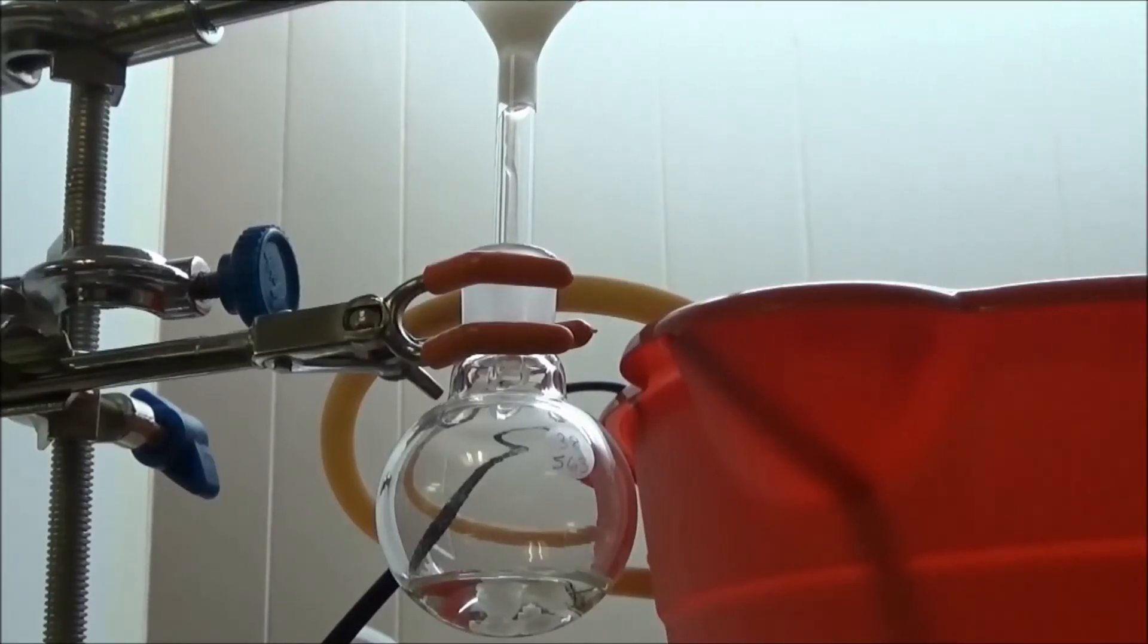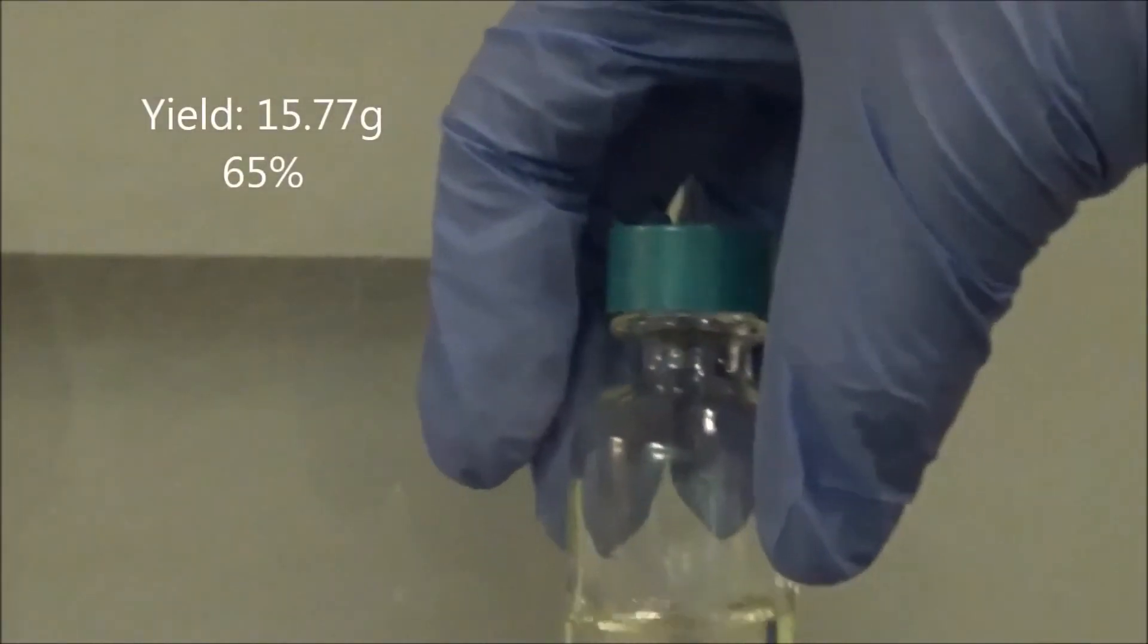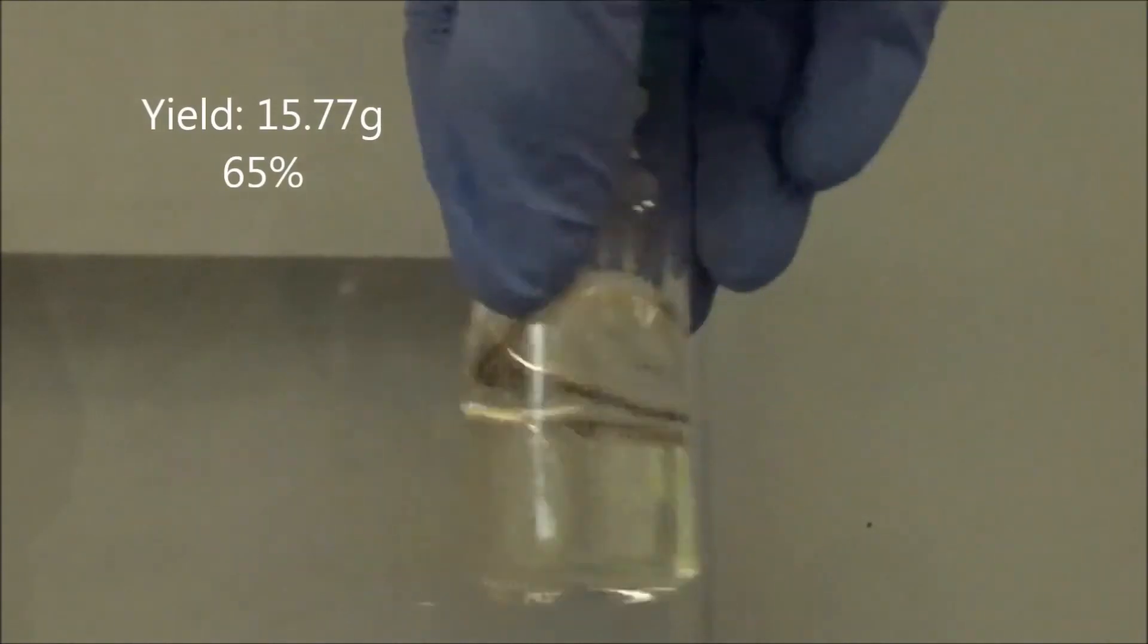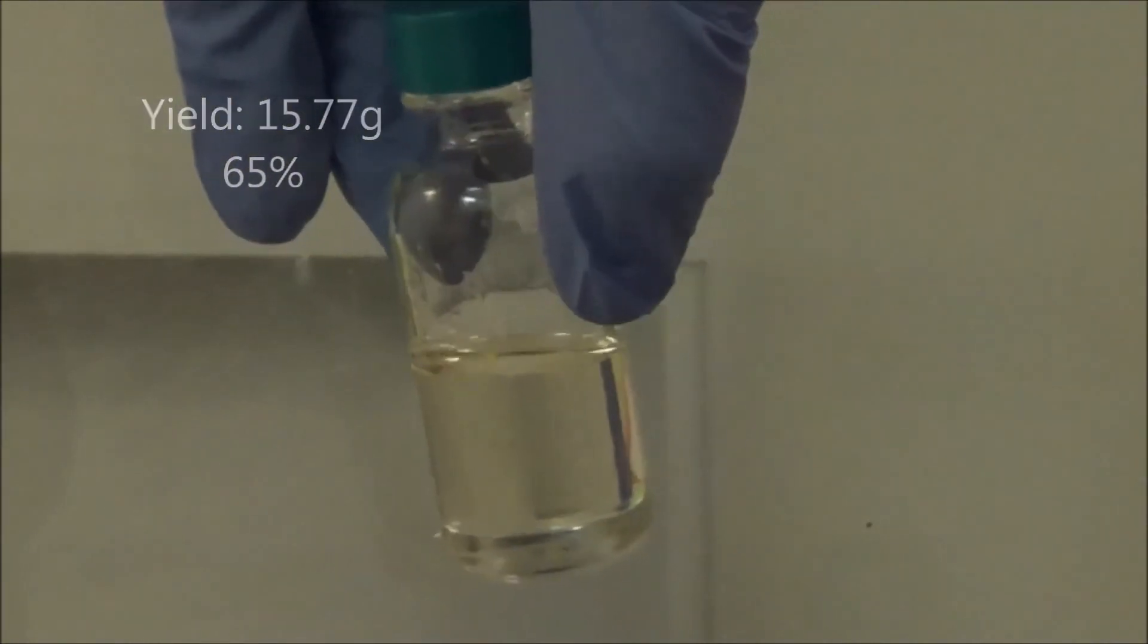Finally, I filtered off the drying agent. The yield was 15.77 grams, a 65% yield based off of phthalic anhydride.